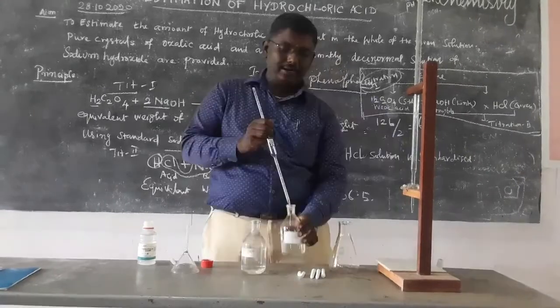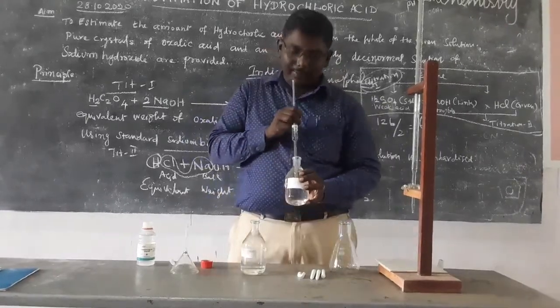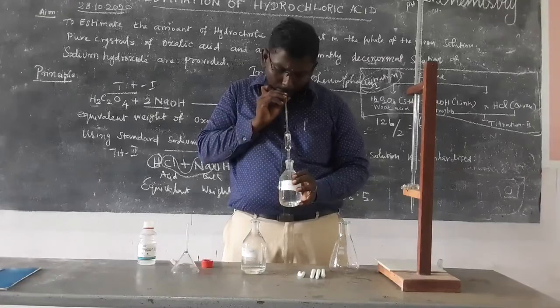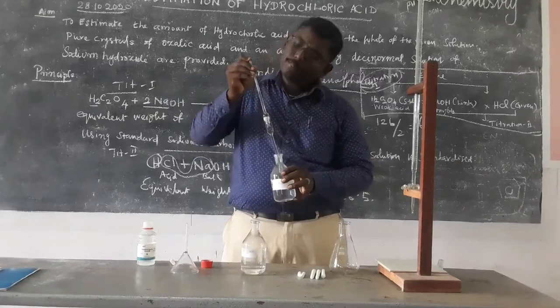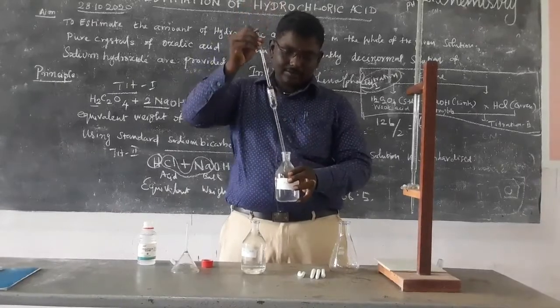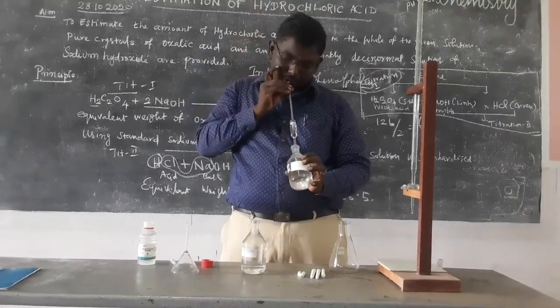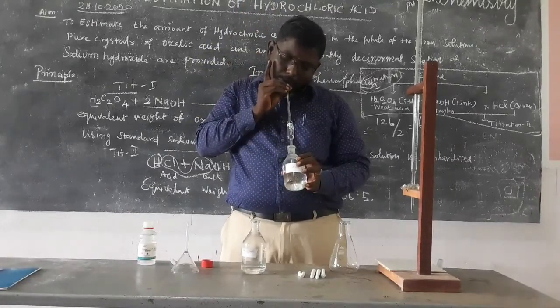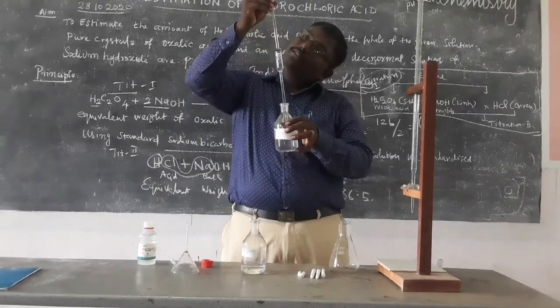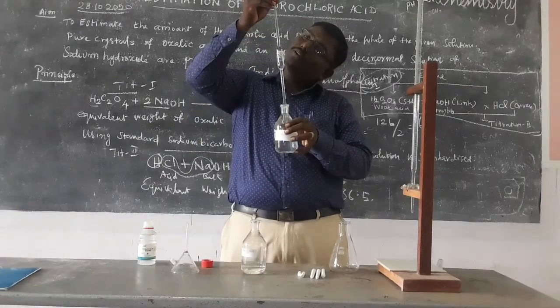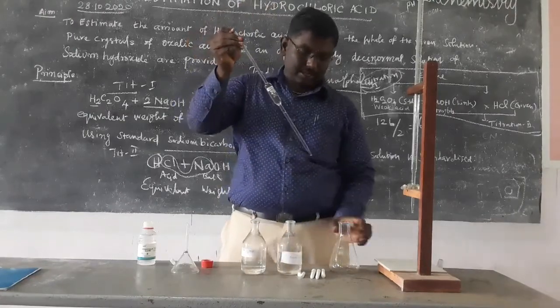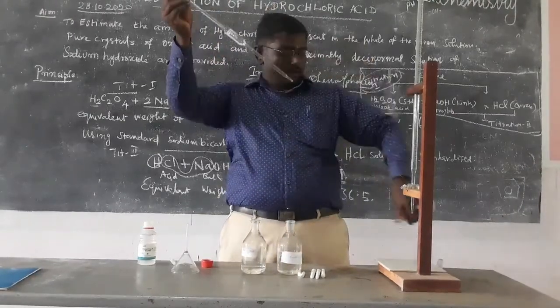I measure from that stock of oxalic acid I have already prepared. Close the line and release the line.